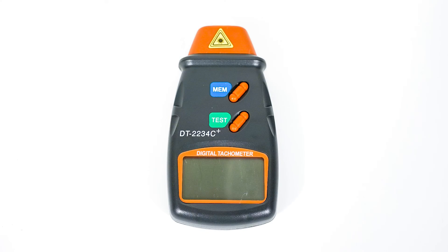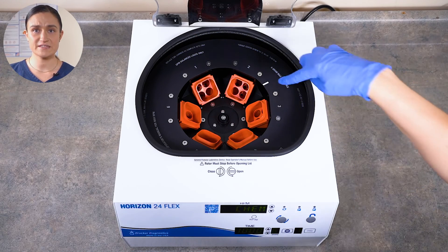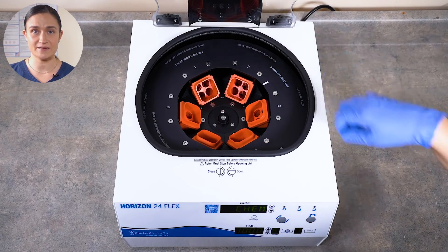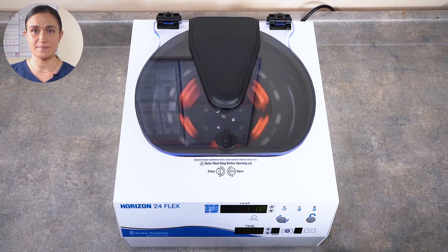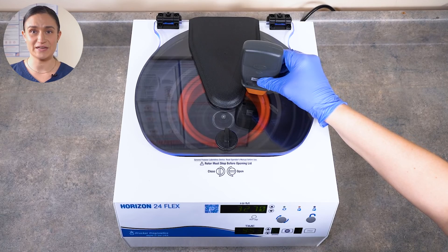Your Horizon 24-Flex does not require any regular maintenance, but you may wish to confirm the spin speed. To do that, you'll need a photo tachometer like the one shown here. Your rotor has a reflective strip on it so the photo tachometer can easily detect the speed. Just start the cycle you wish to test, wait a minute or two for it to reach its peak speed, and point your photo tachometer down through the clear lid. You'll quickly get a reading.